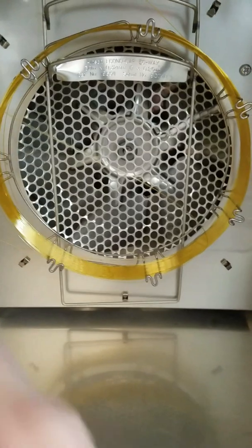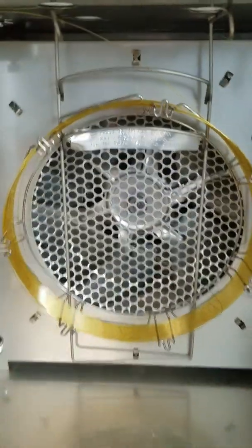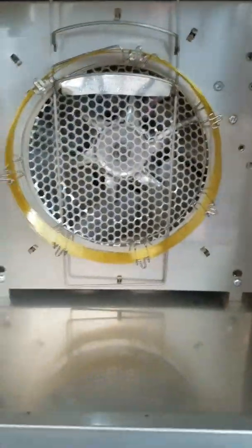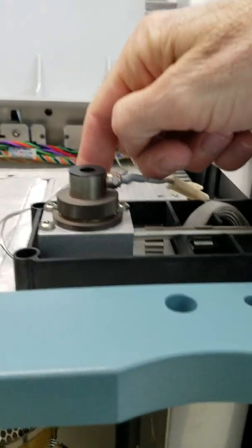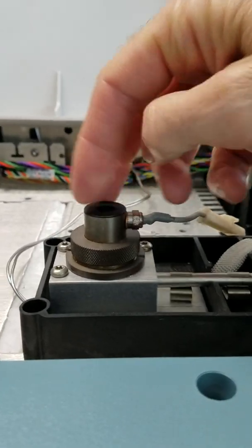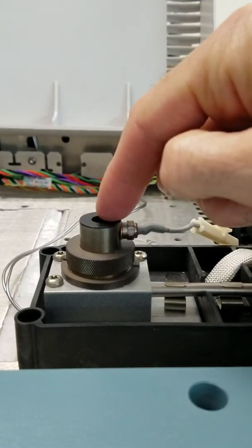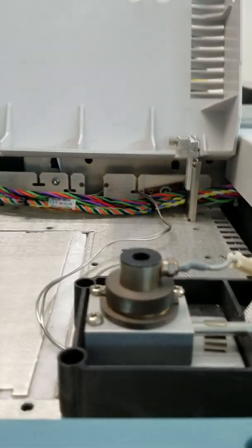The capillary column hooks up to the bottom of the injector on one end. About 30 meters of capillary tubing runs through. On the other end, we hook up to the detector.